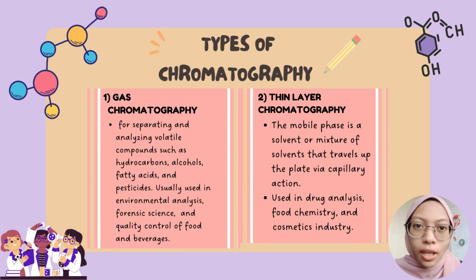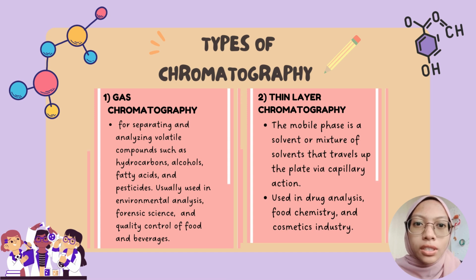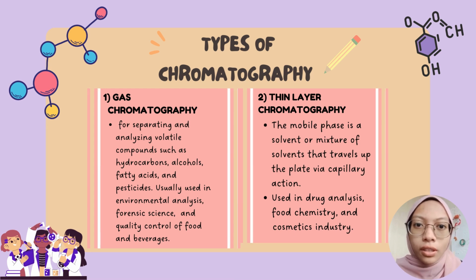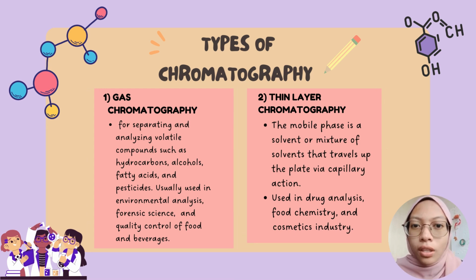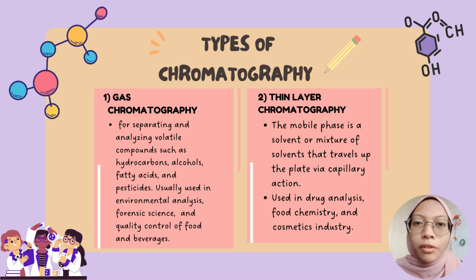Chromatography encompasses several types, each suited to different applications and separation requirements. The first one is gas chromatography, ideal for separating and analyzing volatile compounds such as hydrocarbons, alcohols, fatty acids, and pesticides. Widely used in environmental analysis, forensic science, and quality control of food and beverages.